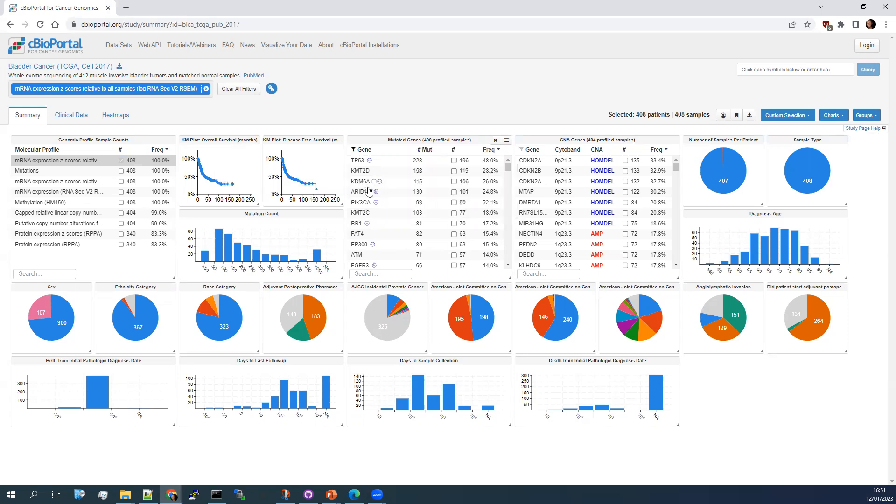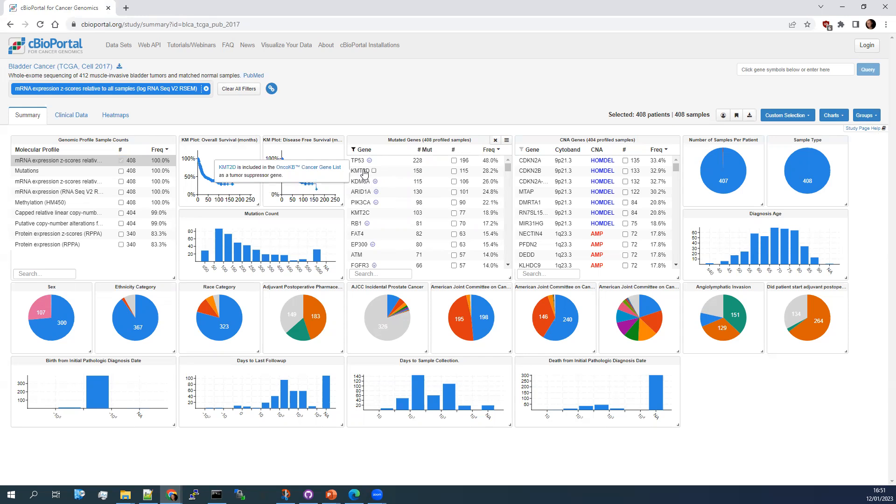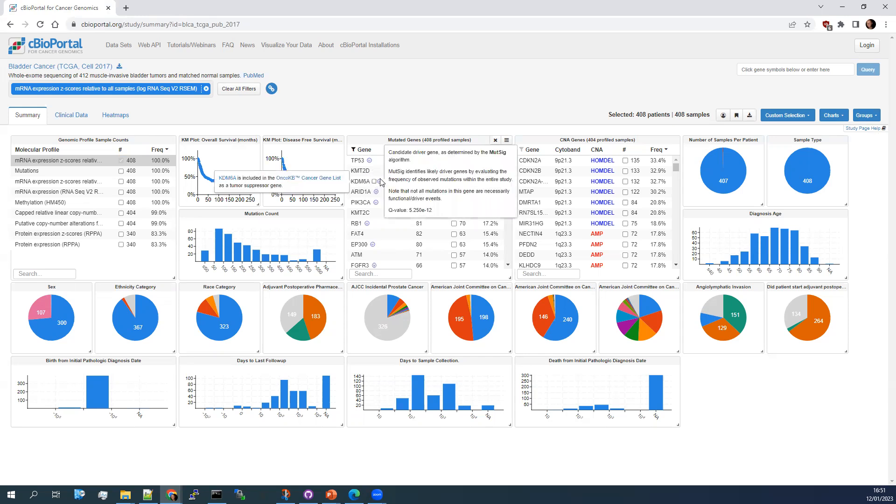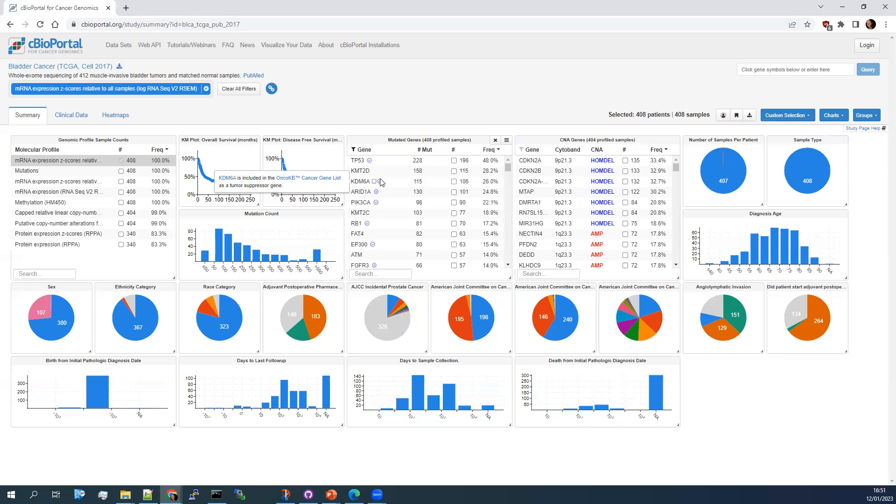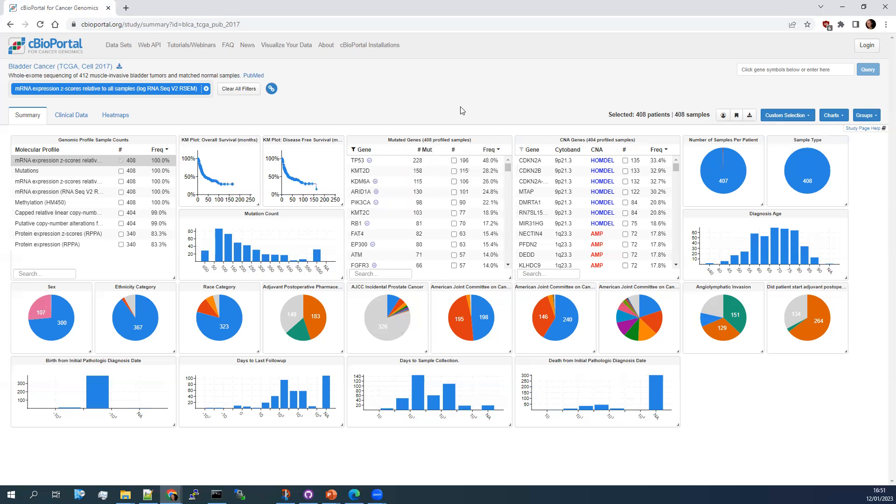So for bladder cancer, for example, KDM6A and KMT2D, both of them do quite a similar job in terms of knocking out a particular complex. KMT2D is not down in this list because of the way it's mutated. You'll notice as well a difference here between the numbers of mutations and the number of patients with a mutation. That means, as you might expect, that some patients have multiple mutations in the same gene.